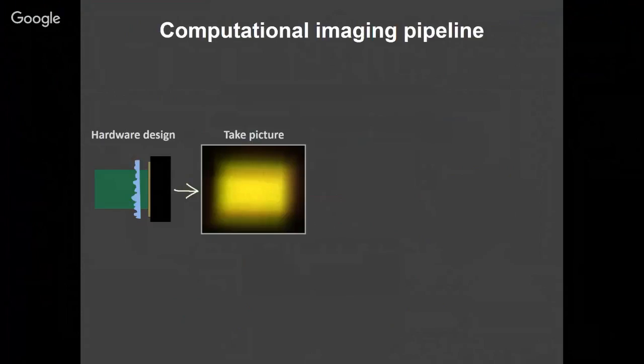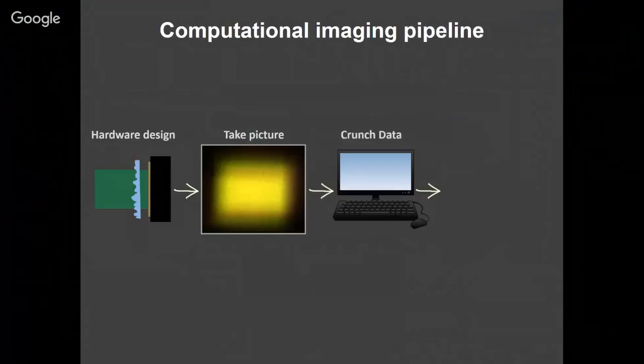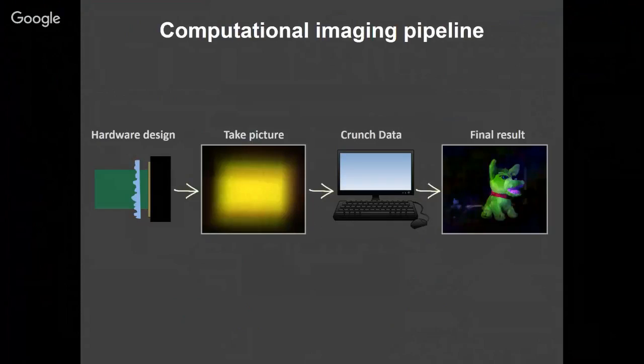And what you get is a picture that also looks like garbage, but now it's structured garbage. And so if we can calibrate this system, we actually can solve an inverse problem and get back a picture of our object from this single image and do this sort of lensless imaging. So I think you saw a talk from the FlatCam guys, Ashok. This is really similar, except this is a phase mask, and we didn't do any fancy design.